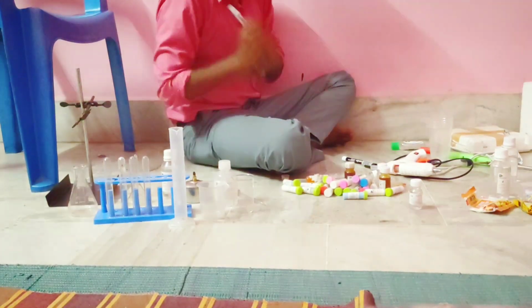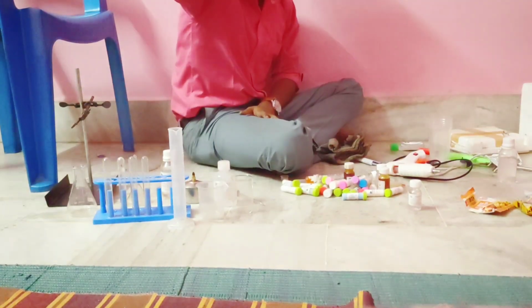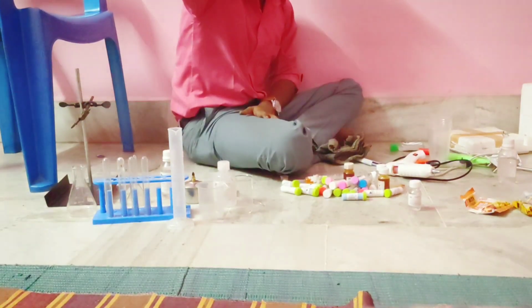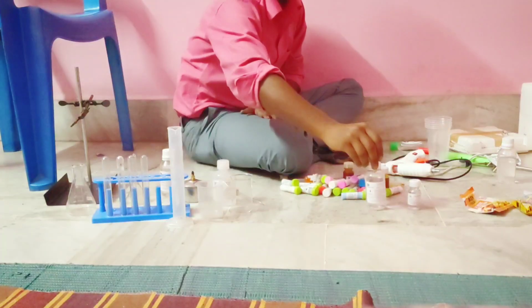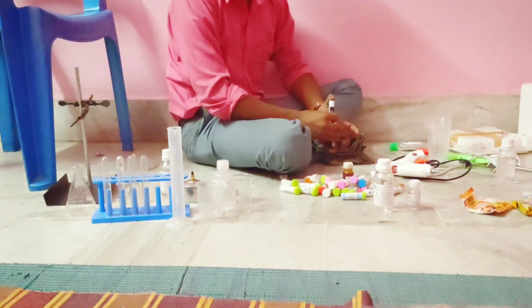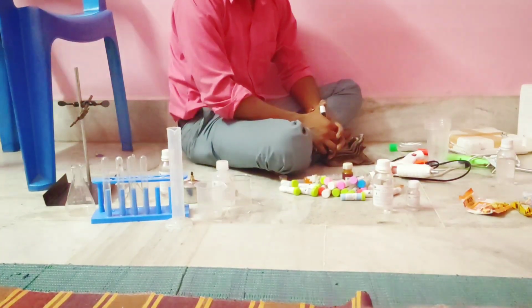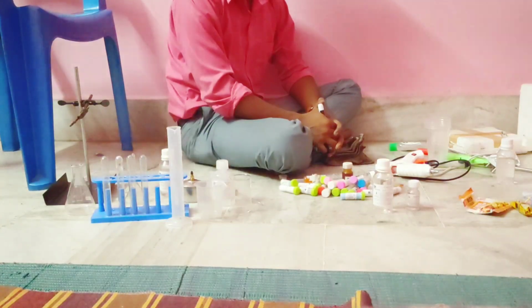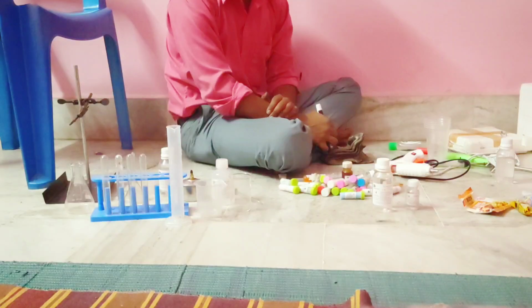Okay. So here is sodium hydroxide. Now there is also sulfuric acid, diluted sulfuric acid solution. That is also called the king of chemicals, isn't it? Sulfuric acid, the king of chemicals. Why? Tell me, what would be the reason? Why is it called the king of chemicals? It has a strong potential.